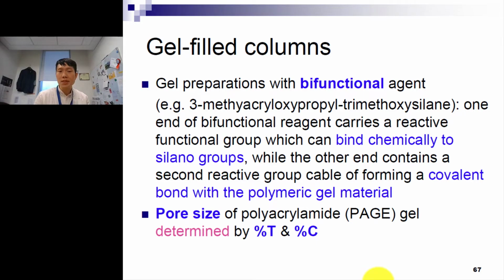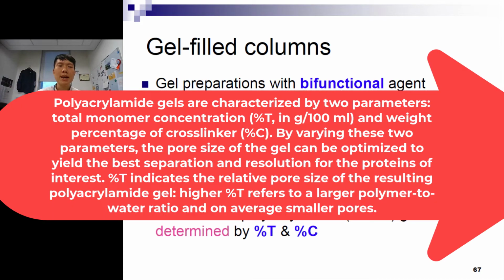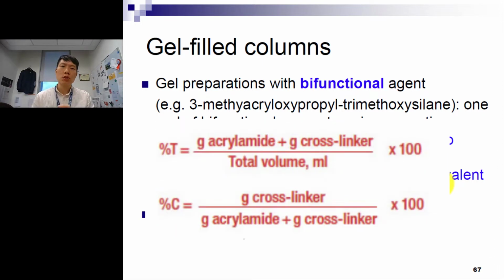So the pore size of this polyacrylamide, in short called PAG, gel is determined by the percentage T and percentage C. PAG, polyacrylamide gel electrophoresis, is characterized by two parameters. The total monomer concentration, we call it the percentage T in gram per 100 ml, and the weight percentage of the cross-linker, percentage C. So by varying these two parameters, the pore size of the gel can be optimized to yield the best separation and resolution for the proteins of interest.